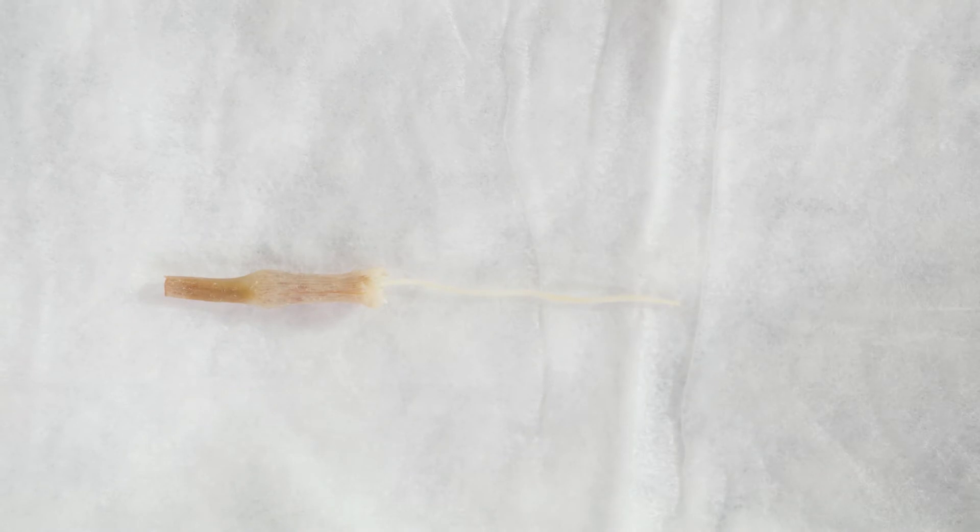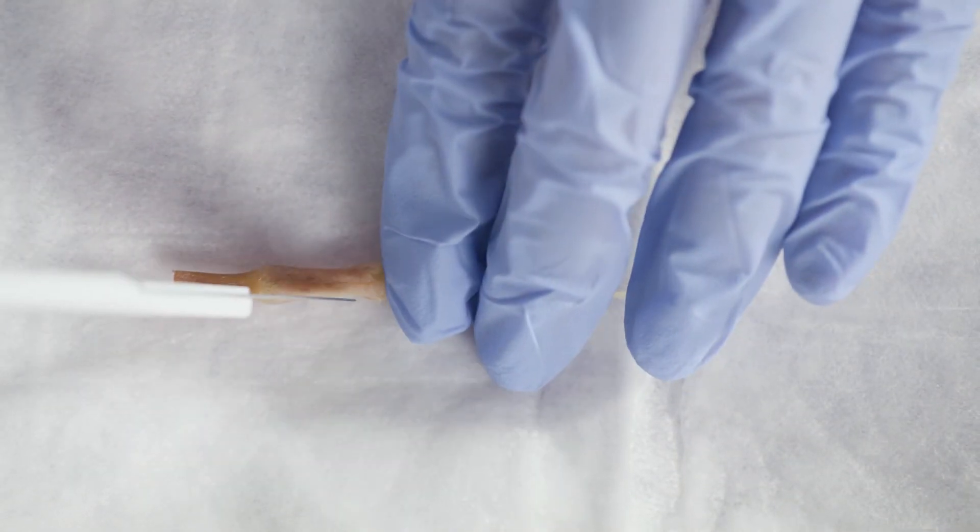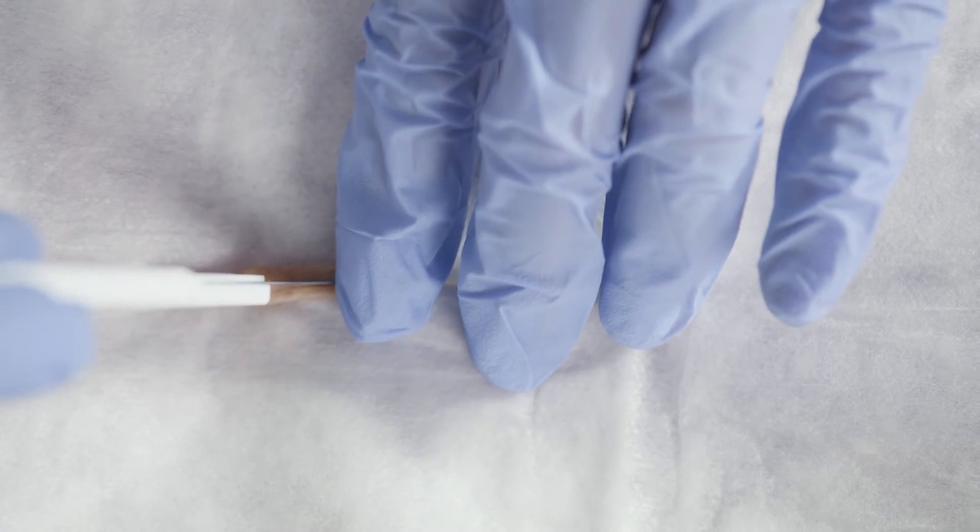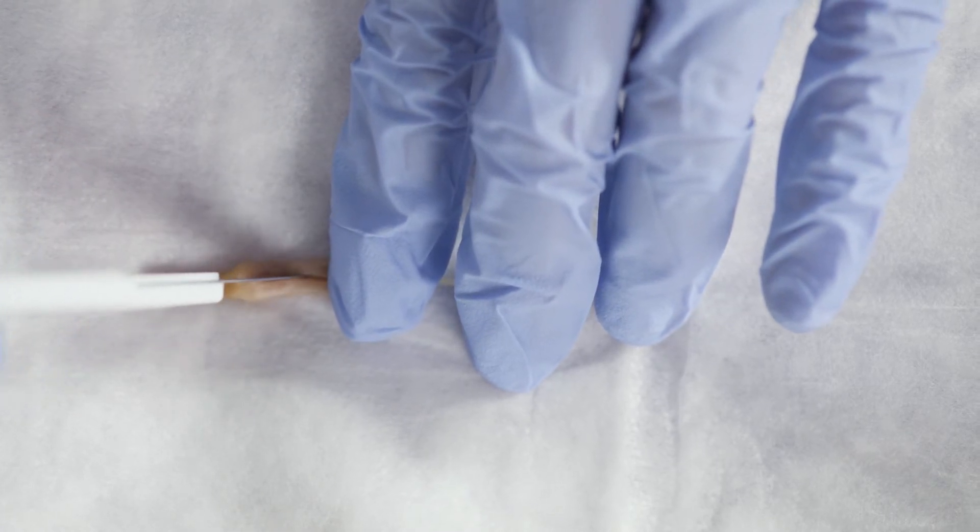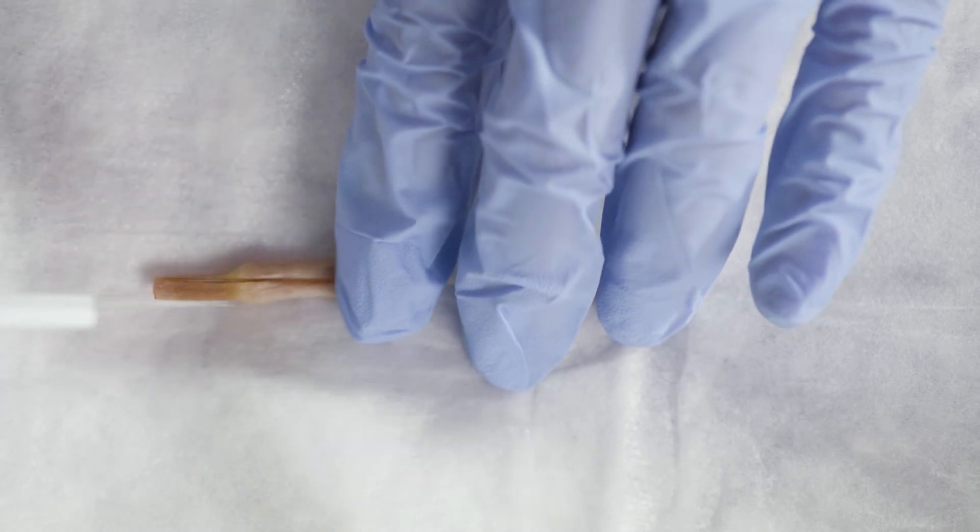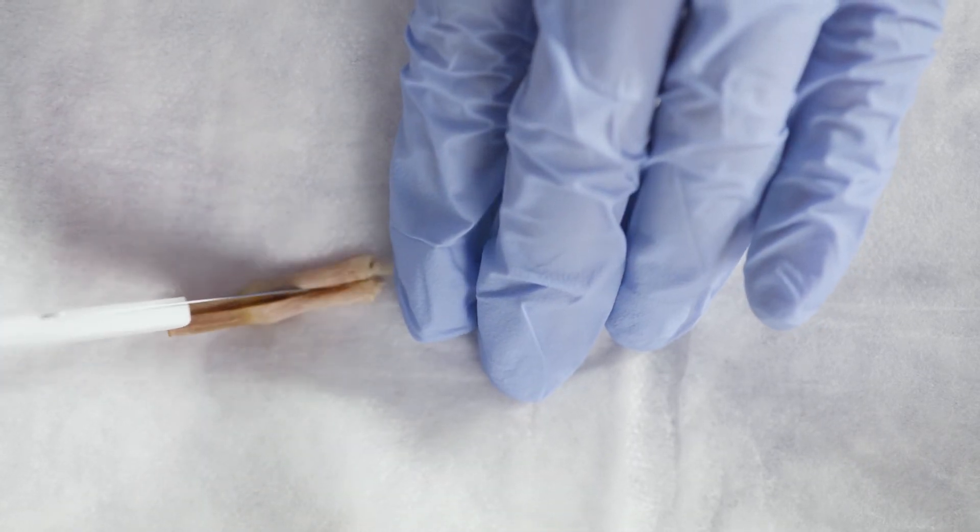In contrast, the daylily has a more obvious ovary. Here we have a daylily with the petals and stamens already removed. Within this darker structure is the ovary, and cutting it in half lengthwise reveals the structures, including the ovules, inside.